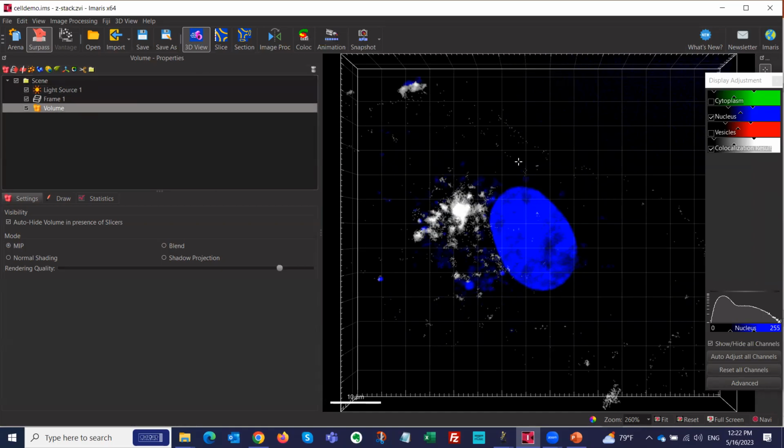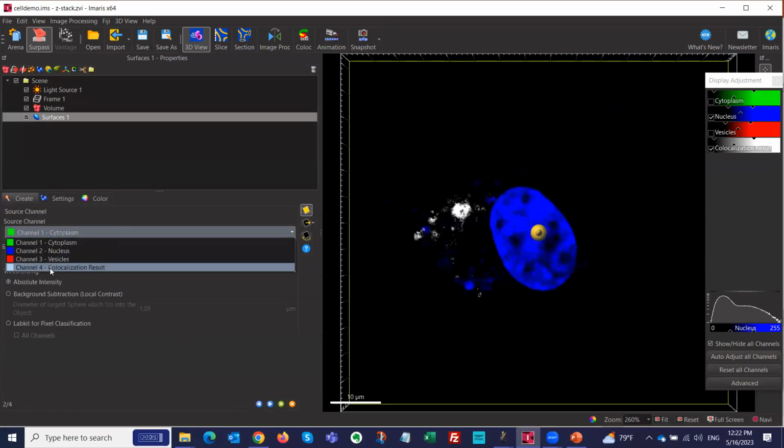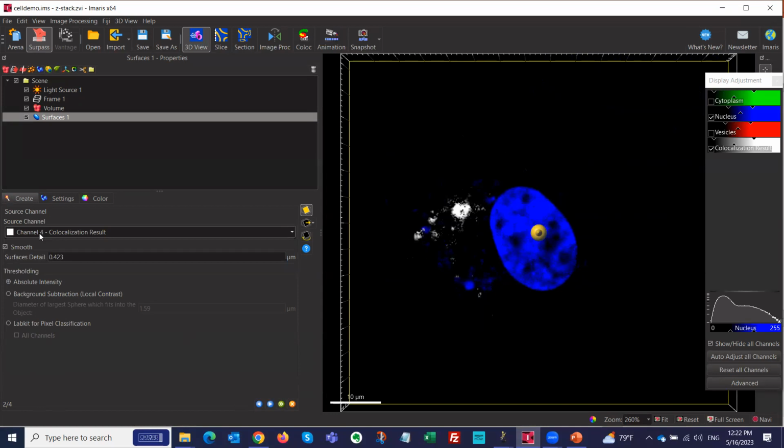Okay, in order to do masking, you do need to have a surface. So I create a surface, and I will turn off those guys. I will look at my new channel that I create, channel 4.